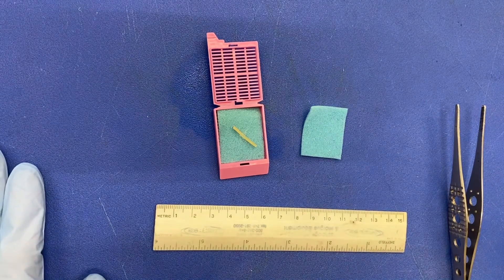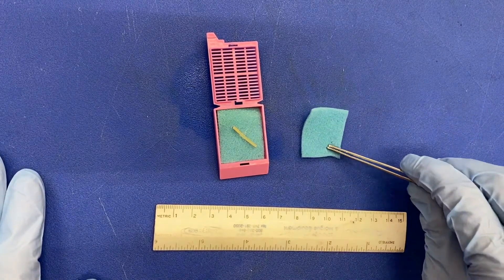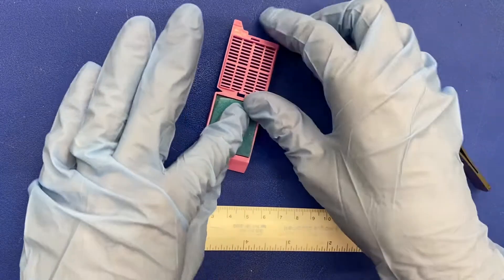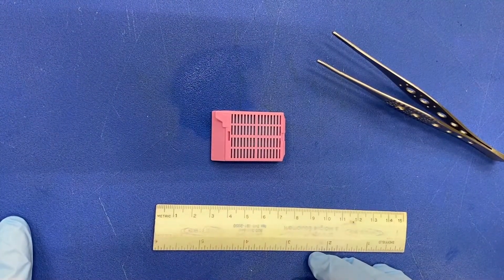After you describe and measure, place another biopsy sponge on top of the specimen and carefully close the cassette. Ensure the cassette lid is closed all the way. Place your cassette in formalin and move on to the next case.